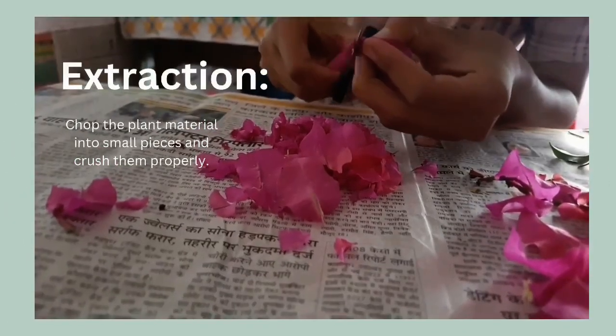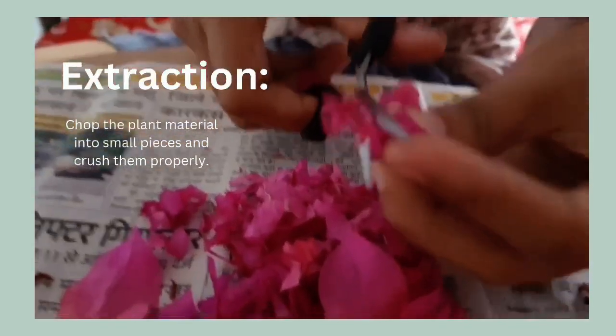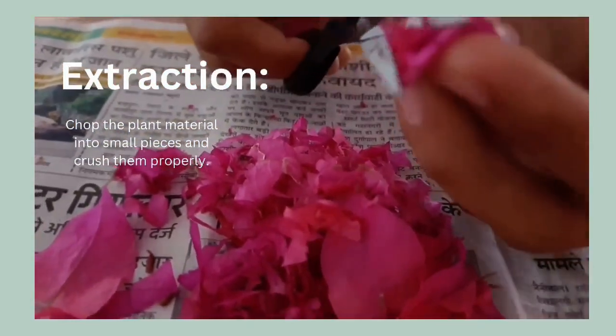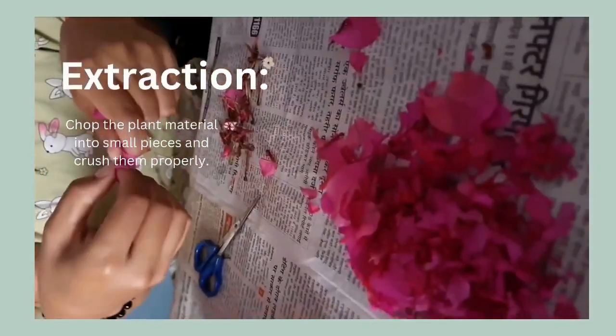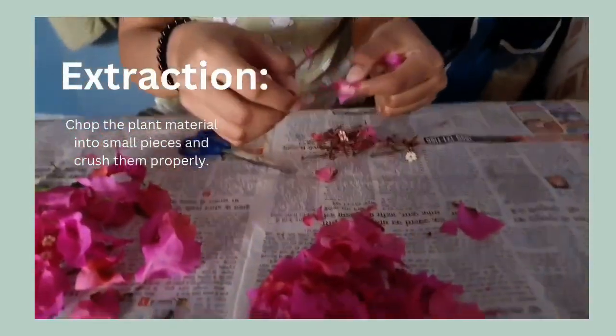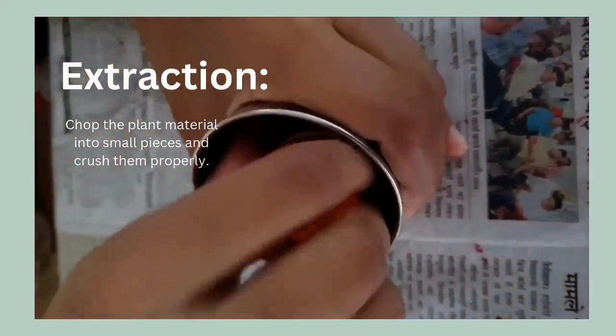magnetic bead. Firstly, we have to filter the bougainvillea extract by using a sieve and then by using grade 1 filter paper. Take 30 ml extract and measure the pH of the filtered extract using a pH meter. If pH is more than 5, then maintain it by adding dilute acetic acid drop by drop, simultaneously checking its pH. Stop when the pH reaches 5.